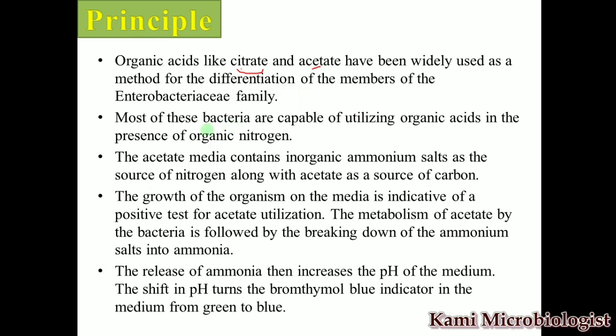Moreover, there are different types of bacteria that use organic acid in the presence of organic nitrogen. The third point says that the acetate media, as we talked, contains inorganic ammonium salt, and it acts as the source of nitrogen, along with acetate that acts as the source of carbon. So ammonium salt is acting as nitrogen, while acetate is acting as the source of carbon.